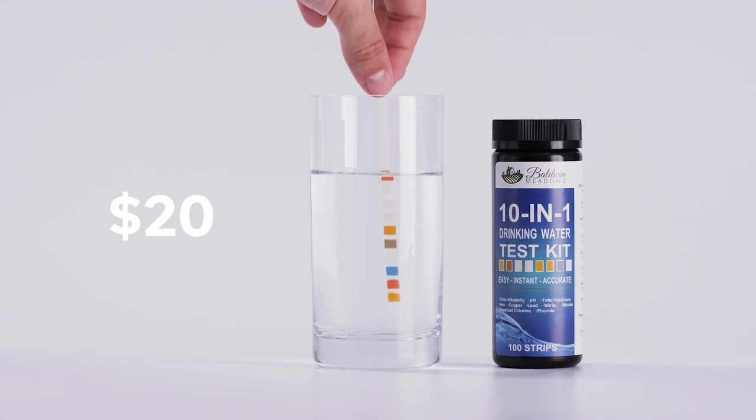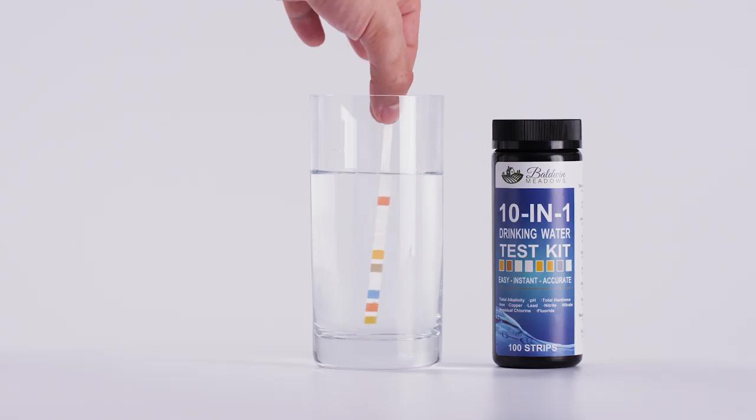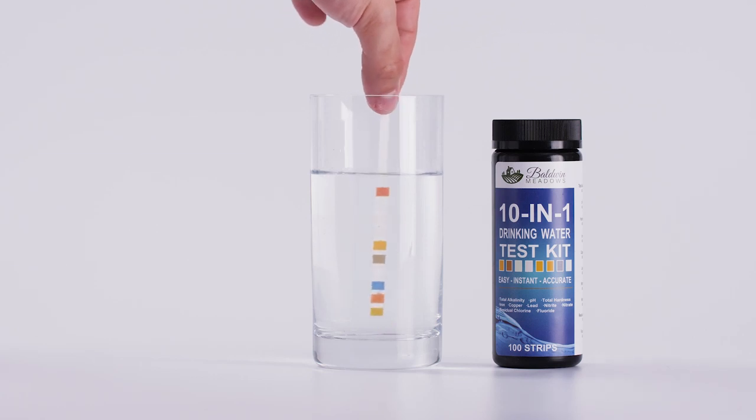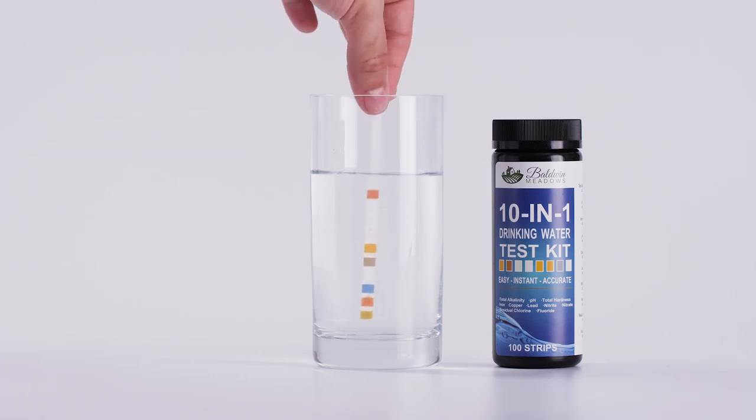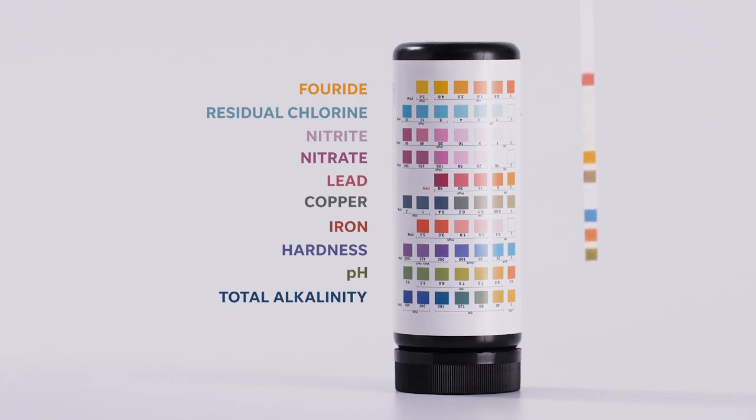The next step beyond a TDS meter is getting some test strips, like a 10-in-1 or 14-in-1 kit. While a TDS meter reads the total dissolved solids, the strip test tells you what's specifically in the water. Completely submerge the strip in the water you're testing, swirl it around for a few seconds, then remove it and you'll see the color swatches change based on the concentration of those elements. Every water is going to react differently, so it's really important that you test your own water that you're consuming.